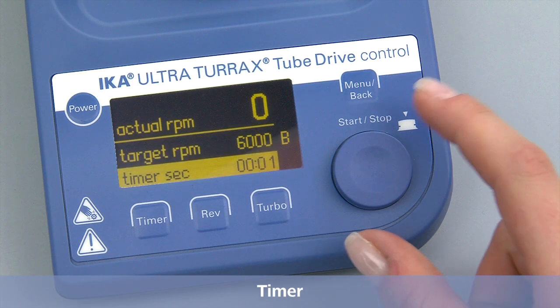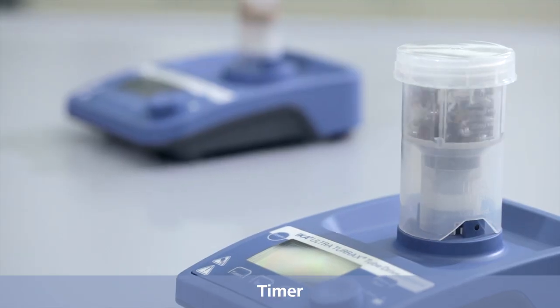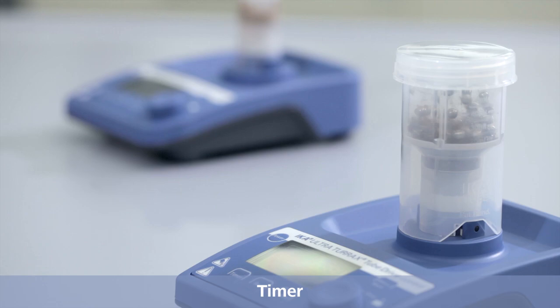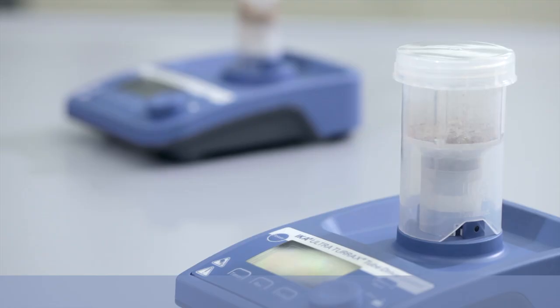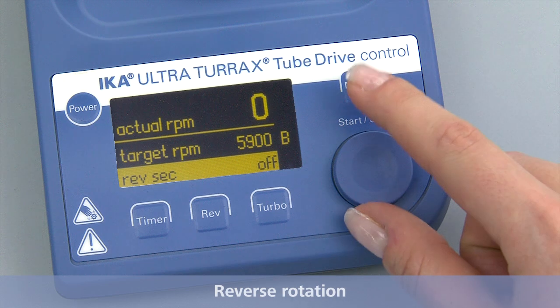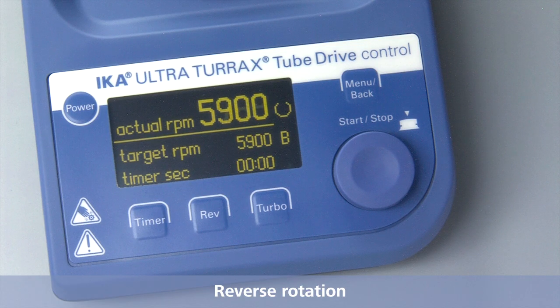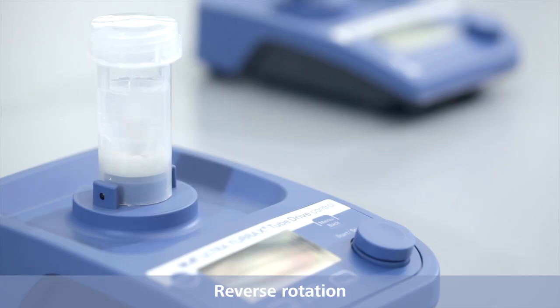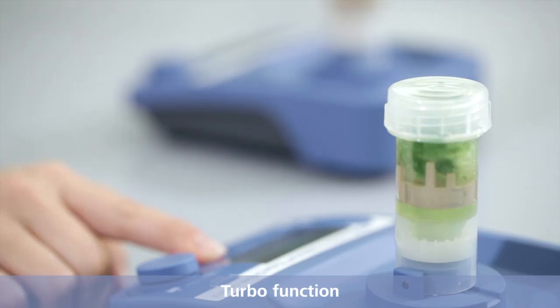Optional features such as a timer, reverse rotation, and turbo function.